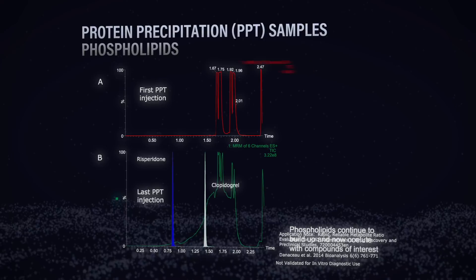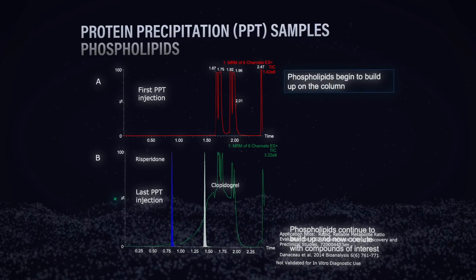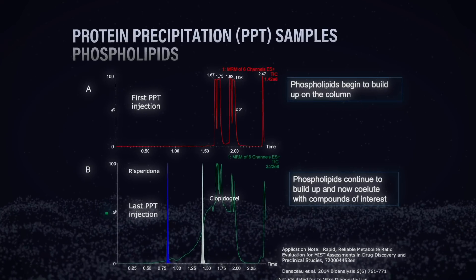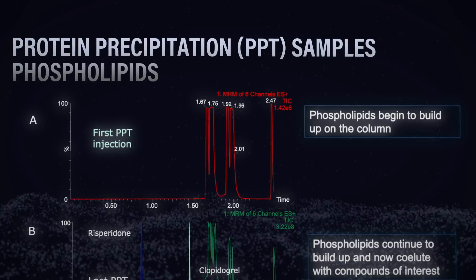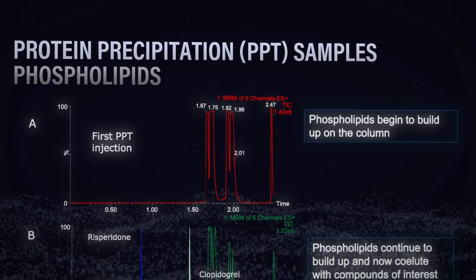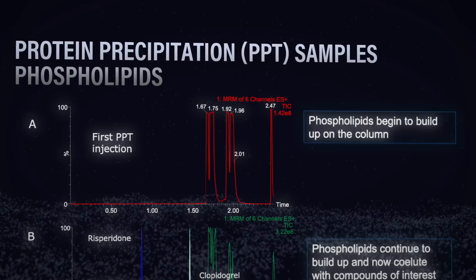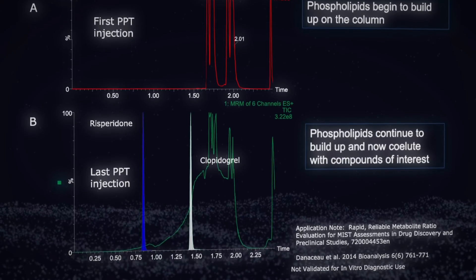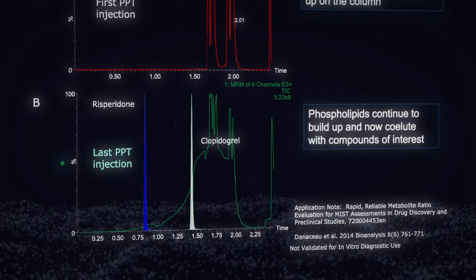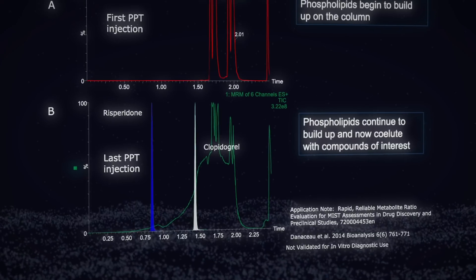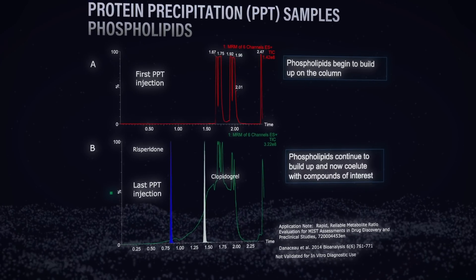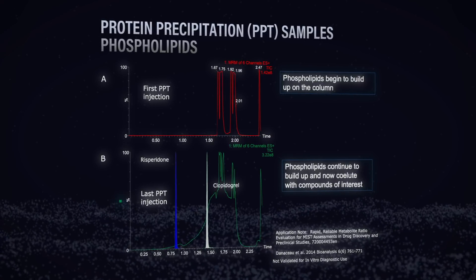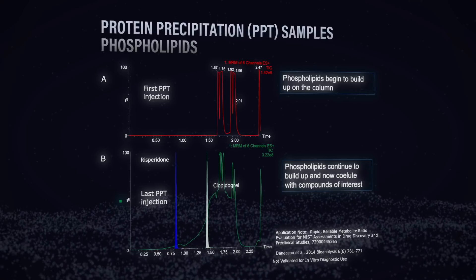If we look at the chromatography to see how these phospholipids actually impact the analytical results, we can see a really interesting story. Looking at the top chromatogram — the first protein precipitation injection — the phospholipids have just started to build up but aren't causing any problem. But by the last injection in the bottom chromatogram, those phospholipids have really built up and are starting to co-elute with our risperidone and clopidogrel, causing matrix effects, higher column back pressure, and problems with reproducible quantification.